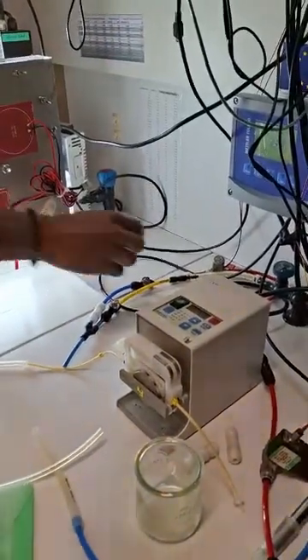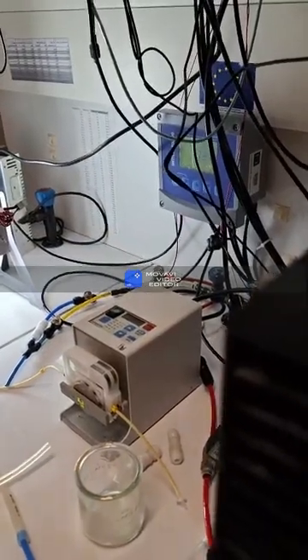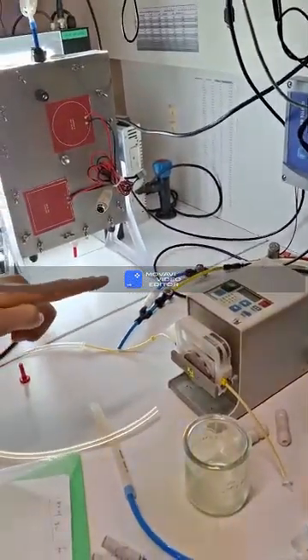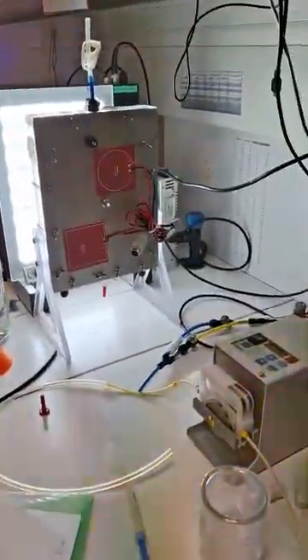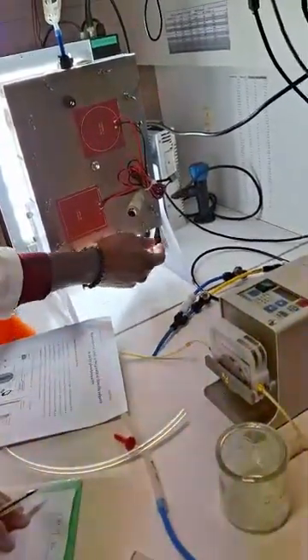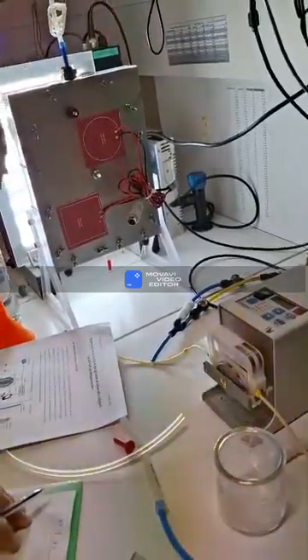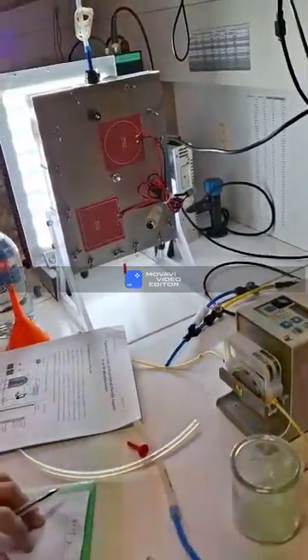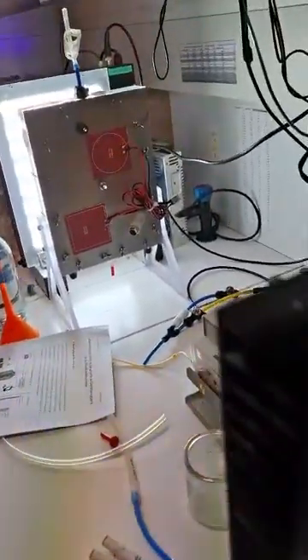It's hot, but it's normal, because the probe is disconnected. You said this is continuous, so we have to have a measure of flow rate. Yes, but we will calibrate it after. First, we just have to plug the connections here before refilling, because it will leak, obviously. And after we will calibrate just the pH probe.